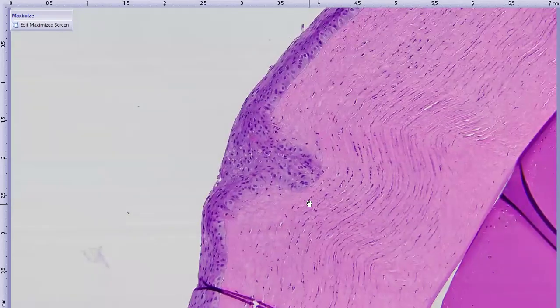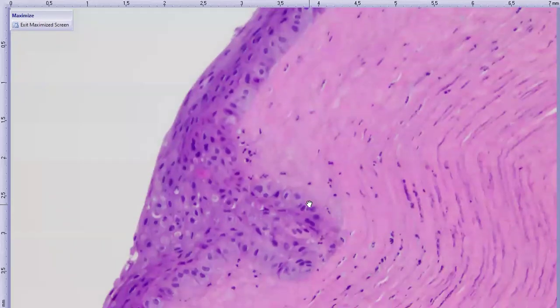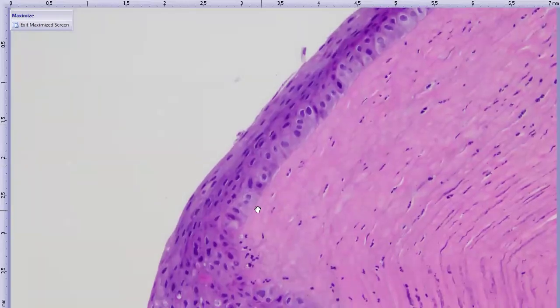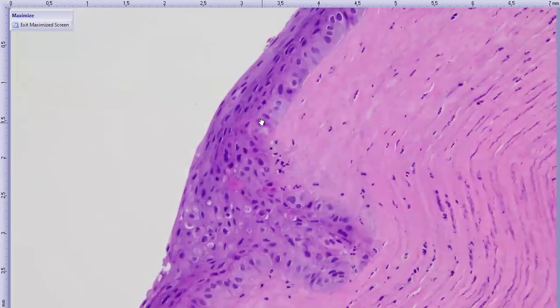There's this little area of the cornea up where the epithelium is hyperplastic. I'll go even one closer. And there are some apoptotic epithelial cells. If we look at kind of the neighboring epithelium, there's a pretty crisp basement membrane. These cells have somewhat normal kind of polarity. They look a little bit more organized. Then we have this region here where they start to kind of extend into the stroma itself.